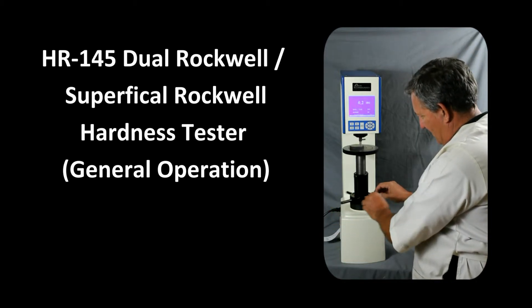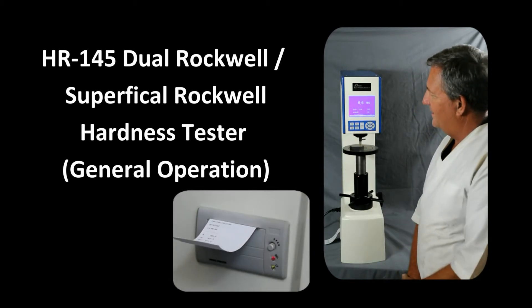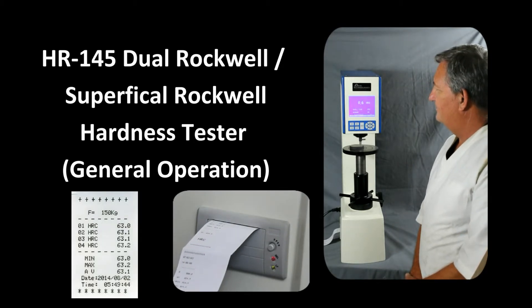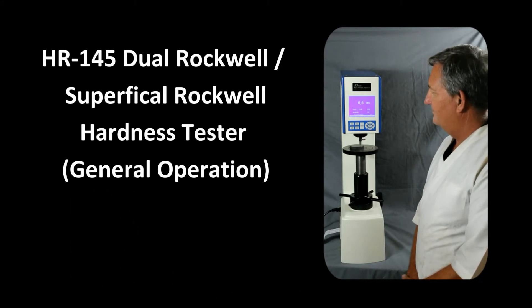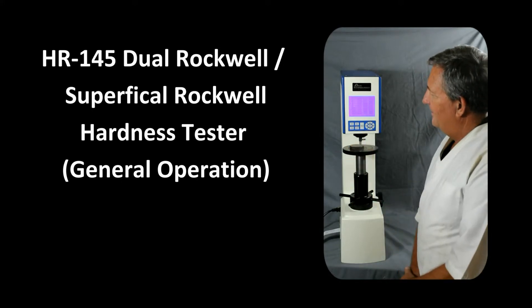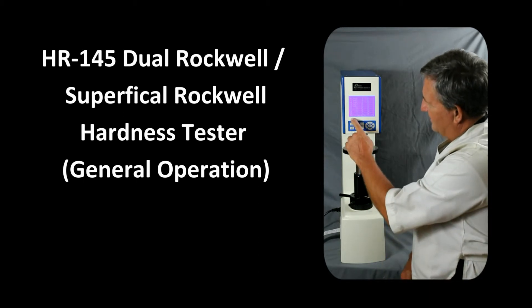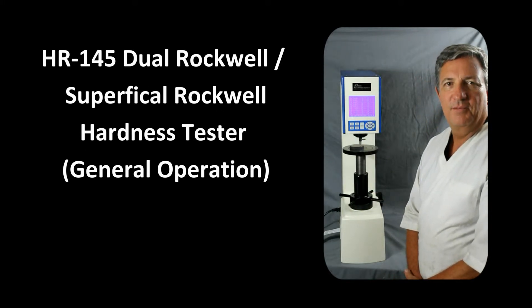Now let's back off the load. After backing off the load, we can print the results by pressing PRT, and we'll hear the values being printed out. We can also press DISP or display to show the last measurements made. In this case, we've done five measurements, and it gives us the minimum, average, and maximum — which is also what's been printed on the paper.